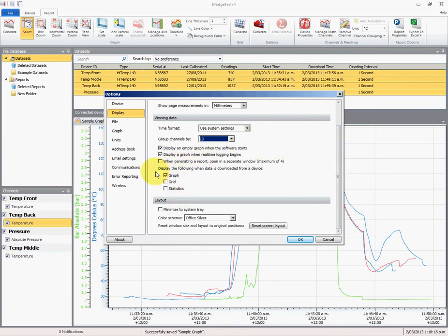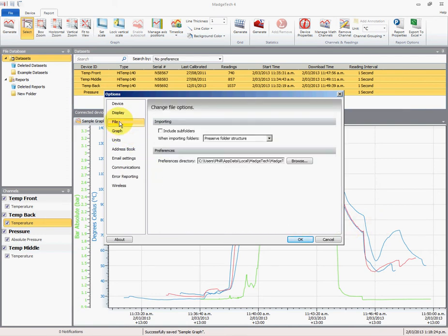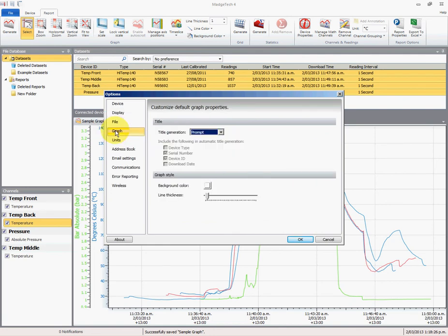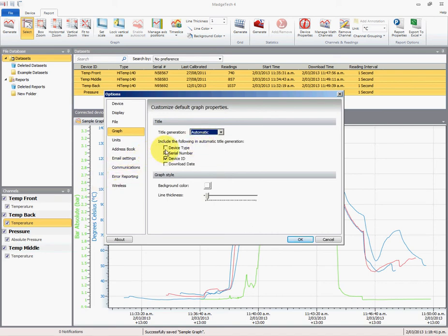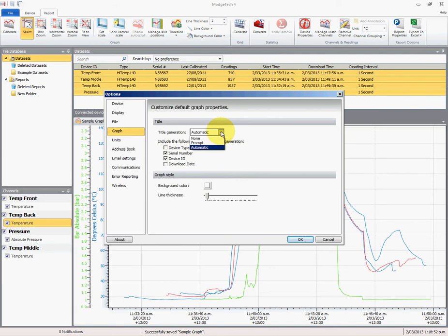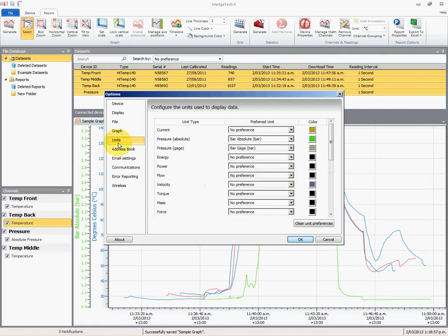When we import the data from a data logger, we're automatically going to create a graph. The next one: file, graph. This is where it's prompting me for the title. We can change it to have none, which would be untitled graph, or prompt, or automatic. If we select automatic, we can use the serial number and the device ID to create the title for the graph. In this instance, I'm just going to go prompt because it makes it a bit easier for me to work with.